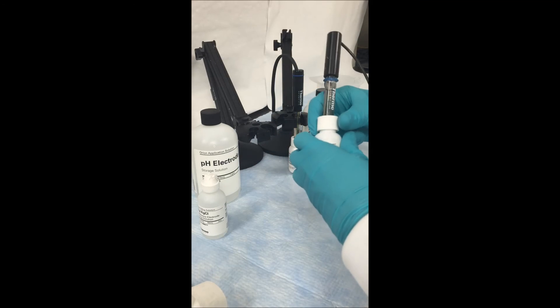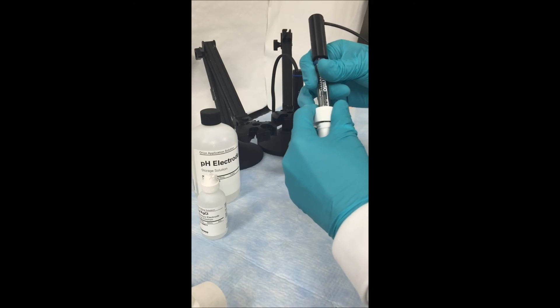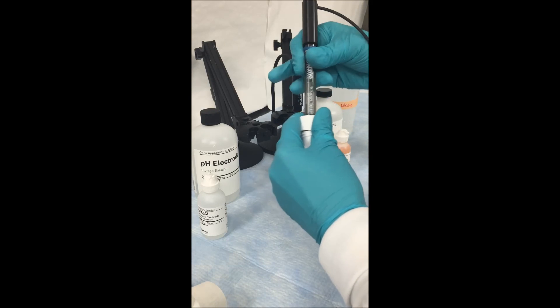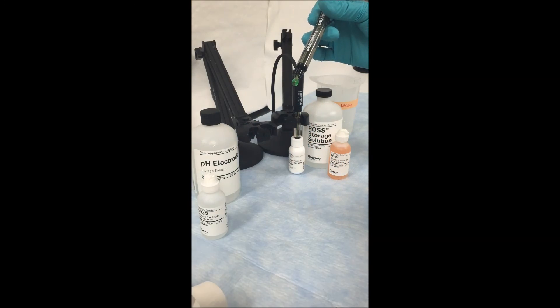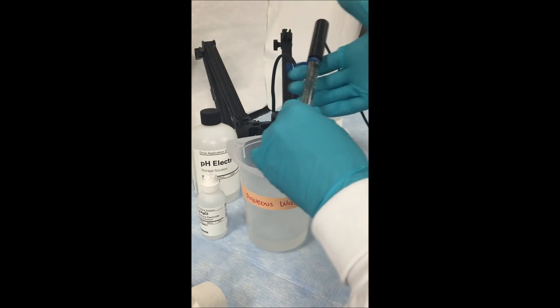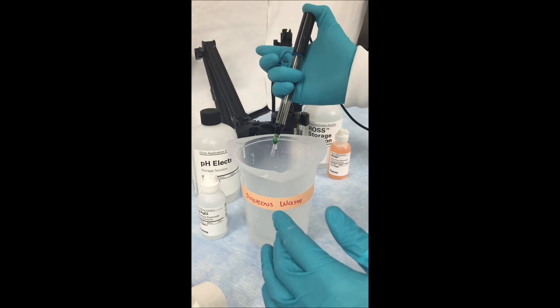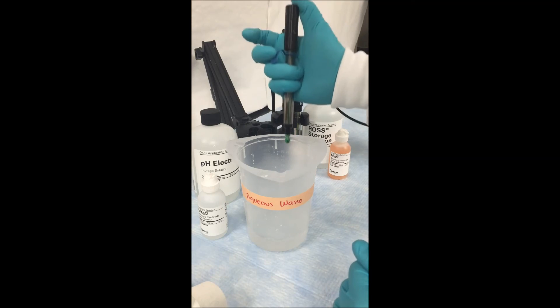First, take the electrode out of the storage bottle, again making sure that you don't create a vacuum while removing it. Once the electrode is removed from the storage bottle, using a waste beaker, uncap the fill hole and then press down on the top of the electrode until all of the internal fill solution has drained.